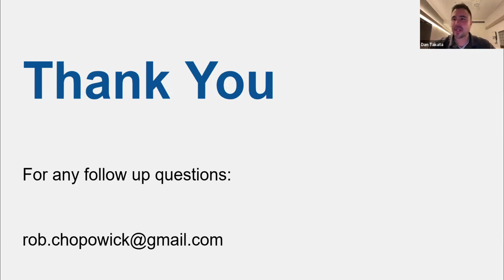With the energy sector using SF6, what is the estimated percentage of SF6 release from USA fume hood testing compared to the energy sector? Good question. I don't have the number. All I can say is our industry, what we put out there, is insignificant compared to the energy use. For those of you who may not be aware, the biggest user of SF6 in North America is our energy sector. It's used for insulating power lines and a few other things that I'm not that familiar with. But I'm not sure they've even been able to nail down a number. But what I can say is it's virtually insignificant compared to what is being put out there.